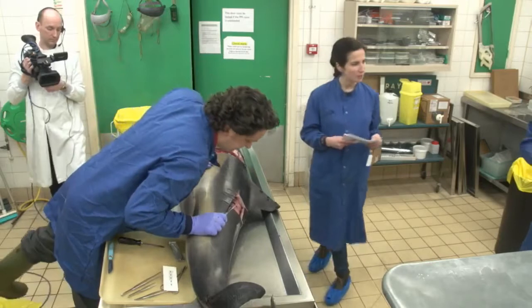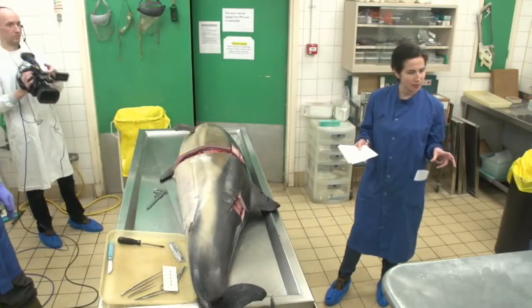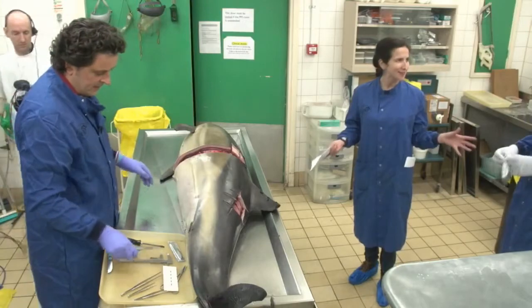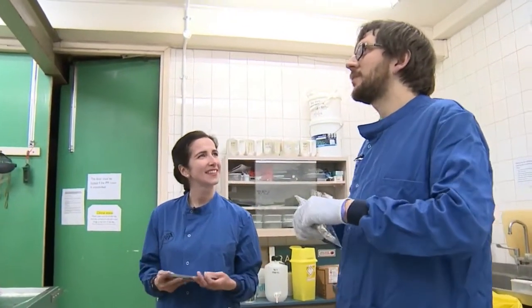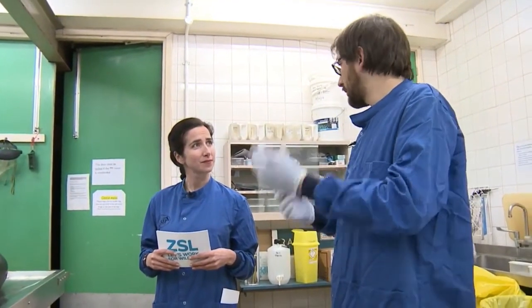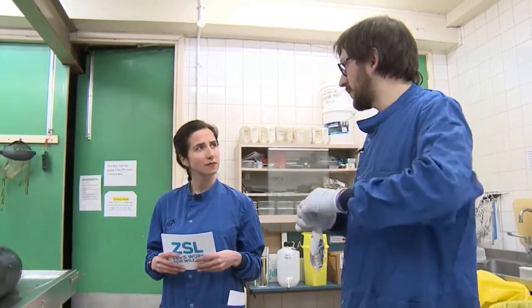Matt, I'm just going to come over to you for a moment because you're busily collecting all of the samples there. And I know a lot of these will actually go into our archives as well. How big are our archives? Have you counted everything that's in there? There's definitely over 80,000 samples in the archive, if not over 100,000 now. It's huge. It's a mixture of everything from frozen samples to formalin fixed samples as well. So it's a lot of samples.